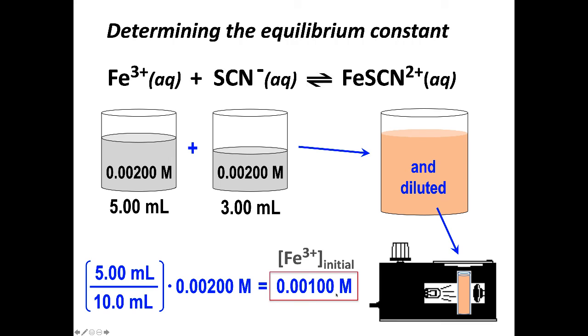So the real solution concentration for Fe3+ initially is, in this example, 0.001 molar, and then it'll react and its concentration will go down as it reacts with SCN- to make FeSCN2+. That'll be a thing we do in the next step, and we'll use an ice table. Okay, so again, note this is just an example calculation. You'll have to do the calculations for your data, and then you'll have to do a similar calculation for SCN-, but it's the same principle.